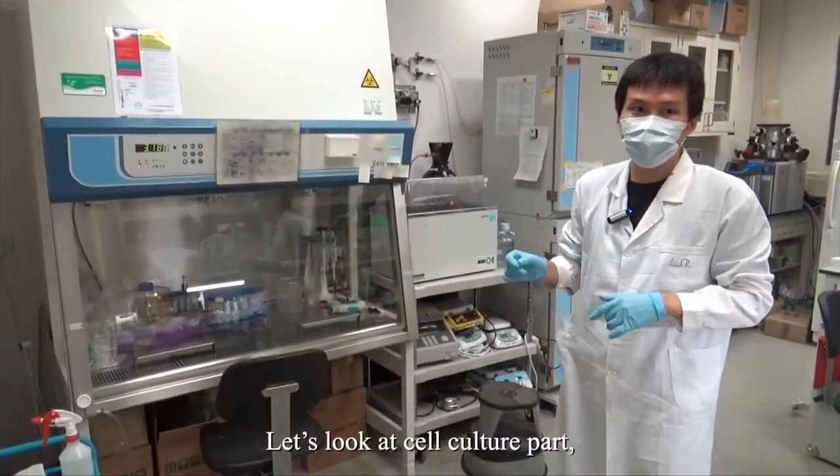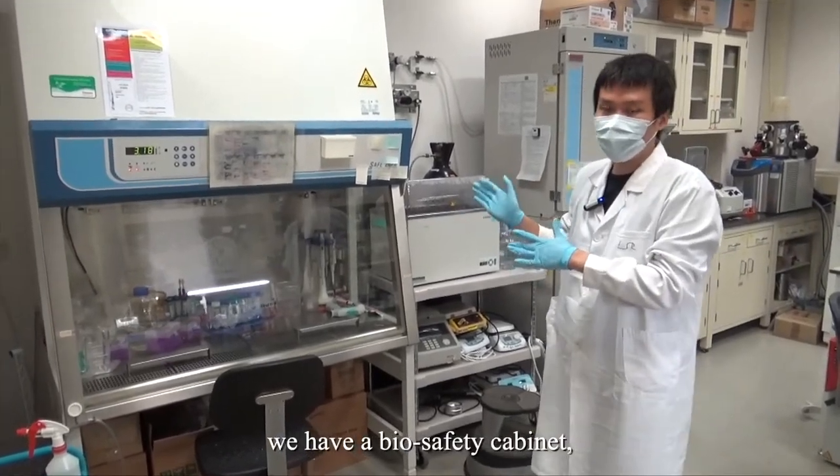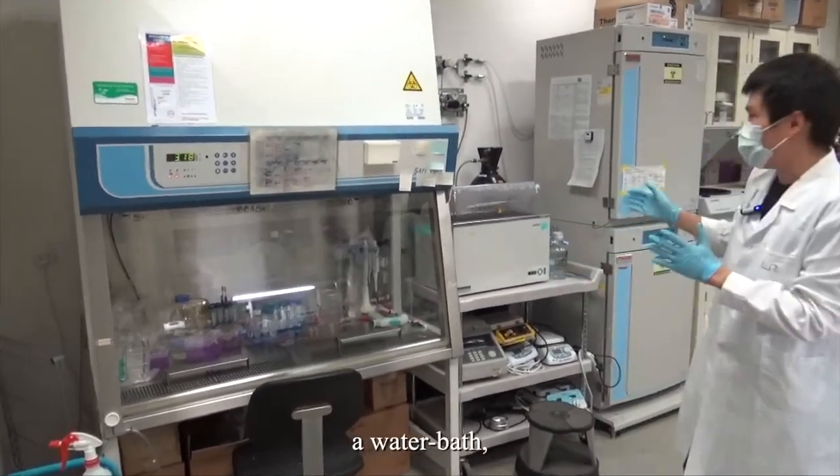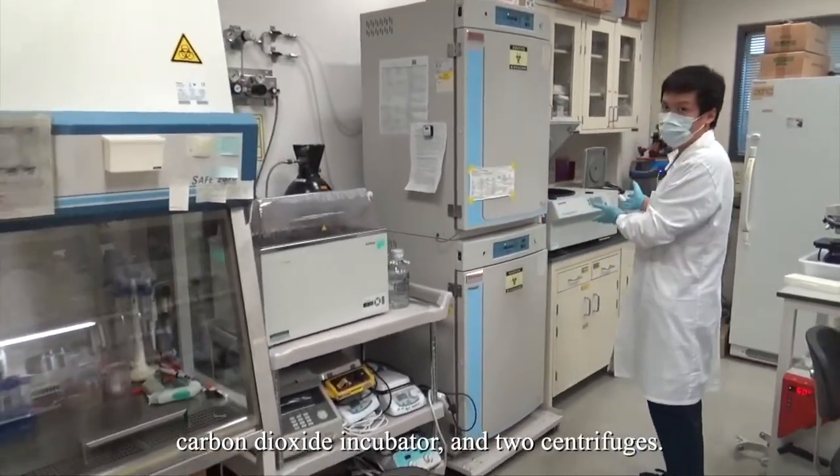Now, let's look at the cell culture part. As you can see, we have a cell culture safety cabinet, a water bath, a carbon dioxide incubator, and two centrifuges.